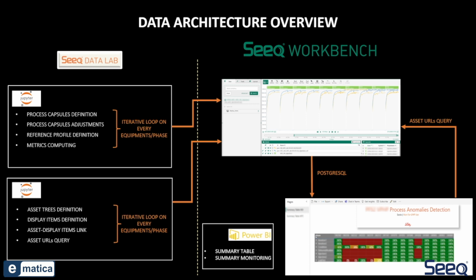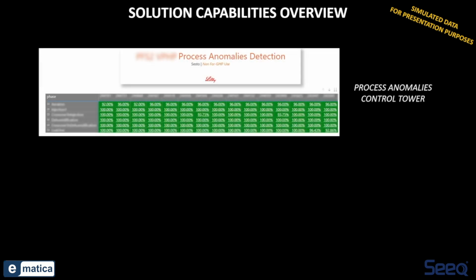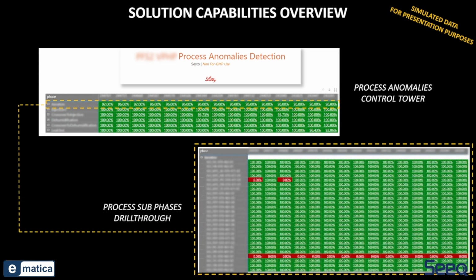we can basically return to anything we're interested in. Now, I'm sorry I needed to cover some things, some confidential data, but this is the situation where for this cycle, for this phase, everything's okay, everything's regular. This means 92% of the probes that we are checking are okay. Now, something can go wrong, and you can identify which probes are not okay. And you can check that for each cycle, and see which cycles are having issues.